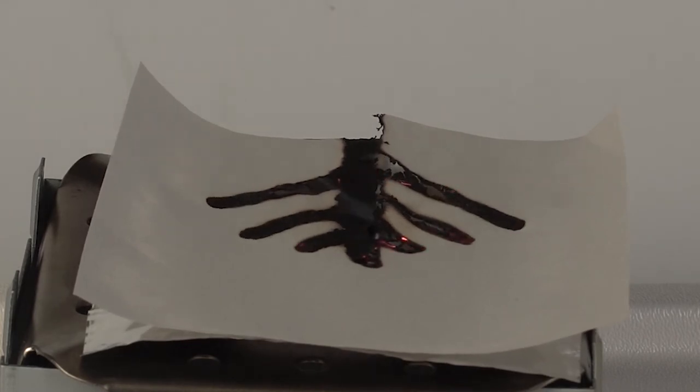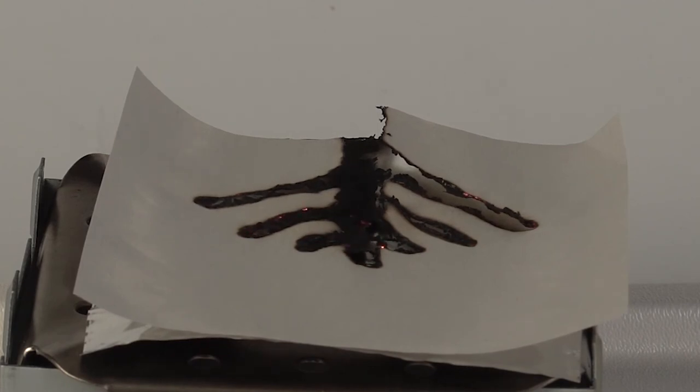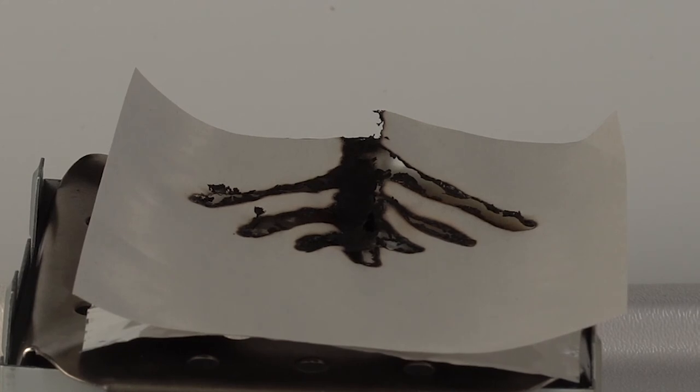However, because sodium nitrate decomposes into sodium nitrite and oxygen when heated, there is a higher concentration of oxygen on the parts of the paper where you have painted your pattern, as opposed to the concentration of oxygen in the air. This is why the parts of the paper painted with sodium nitrate smolder faster and more strongly, revealing your pattern as a burned image on the paper.